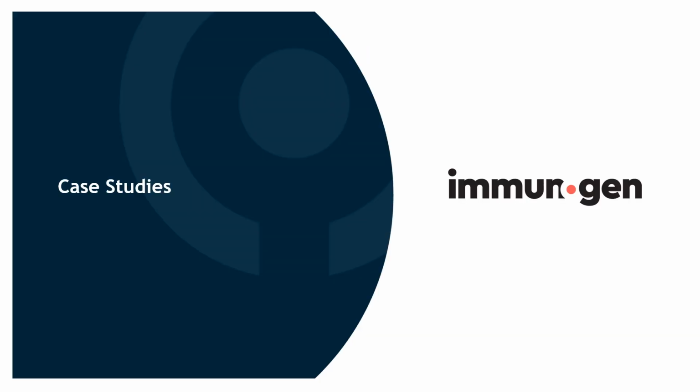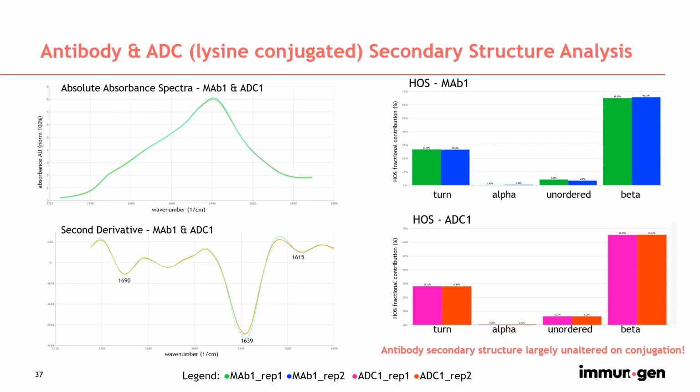Now let's move on to some case studies where we used MMS to study antibody and ADCs and the effects of pH and thermal stress on the secondary structure of these molecules. To begin with, we used MMS to look at the secondary structure of an antibody and its corresponding lysine-linked ADC.